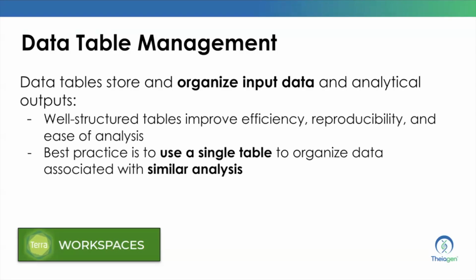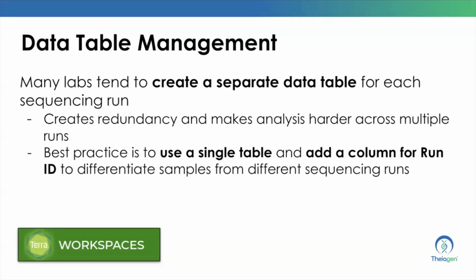And one best practice to keep in mind when using Terra is to use a single data table to organize data associated with similar analysis, rather than creating unnecessarily separated data tables. And this is a key practice, as many labs tend to create a separate data table for each sequencing run. But this practice can cause a lot of downstream issues, making it harder to analyze multiple runs together. It also requires extra effort to compare results across the different data tables. And, in general, increases the chance of errors as it requires continuous updates of workflow inputs and configurations to account for the separated data tables.